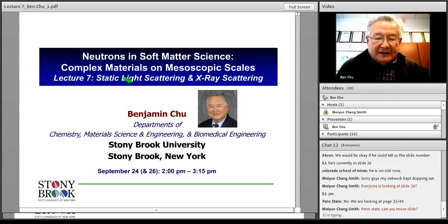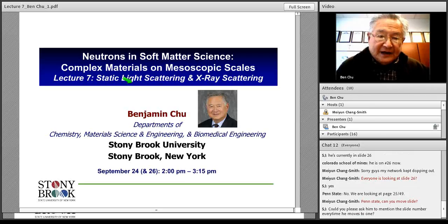Consequently, you can think about a solid dissolving in the solvent, and now you can see that if the refractive index of the solid is different from that of the solvent, then the dn/dc will be larger. So therefore, in this case, it's this term you'll be looking at.